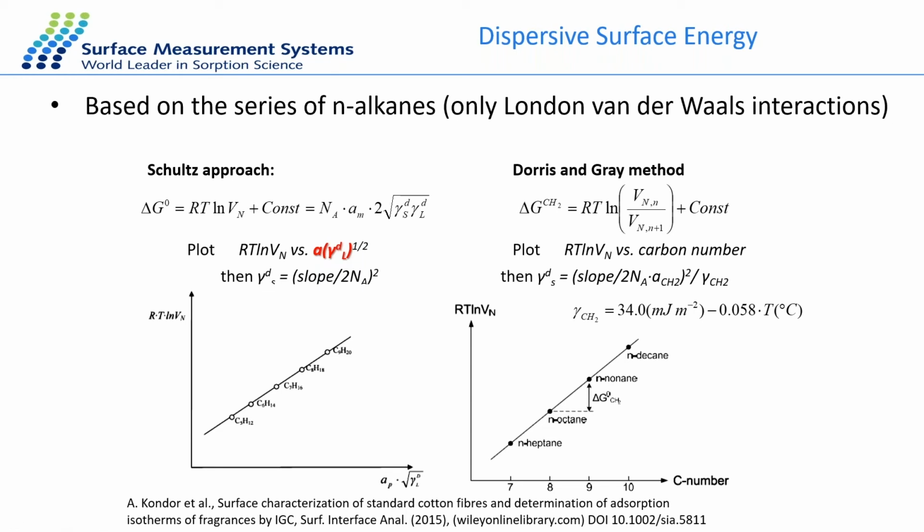So these values come from the literature, and these are measured at room conditions. So that's why this method is a little bit limited to room or ambient conditions.